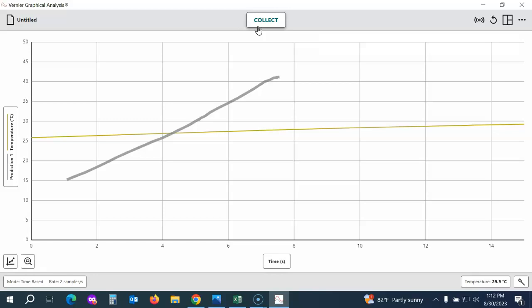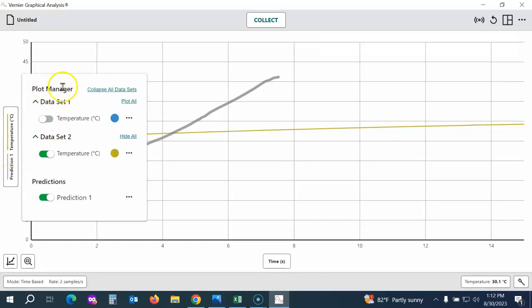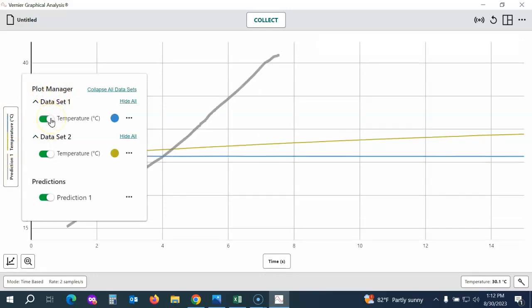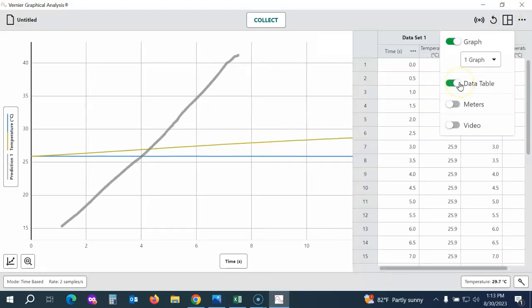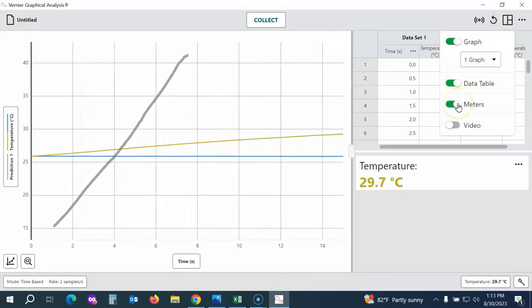Now, to see both data sets at the same time, I just need to click on the y-axis to bring up the Plot Manager. That allows me to turn on or off any of the data sets as well as my prediction. I can also view the data table. In the upper right corner under View Options, I can turn on the data table and also turn on the meter.